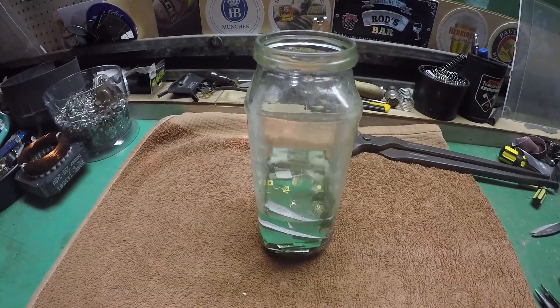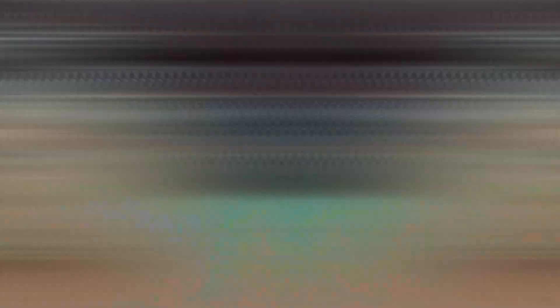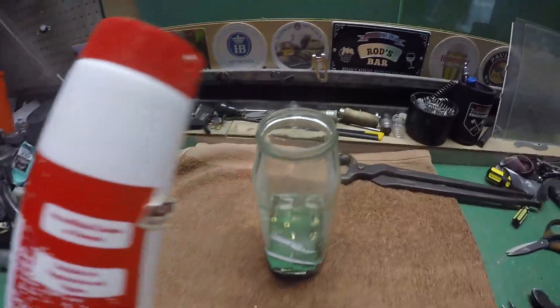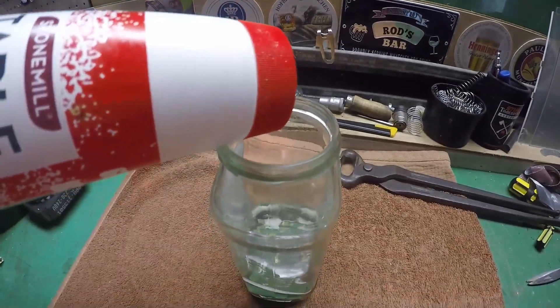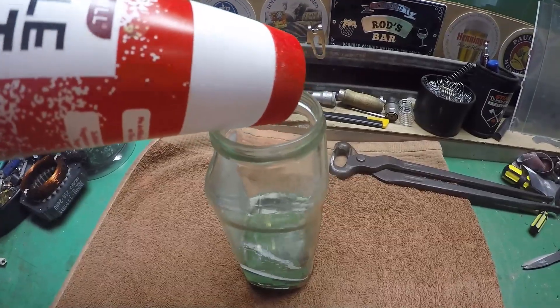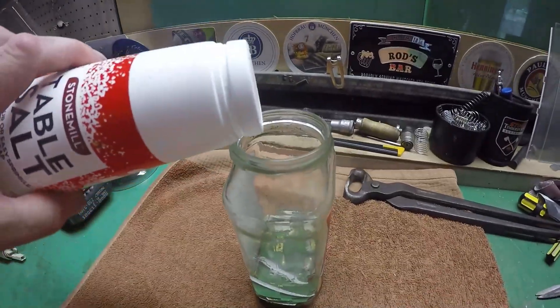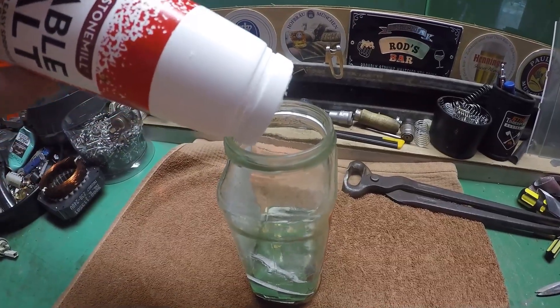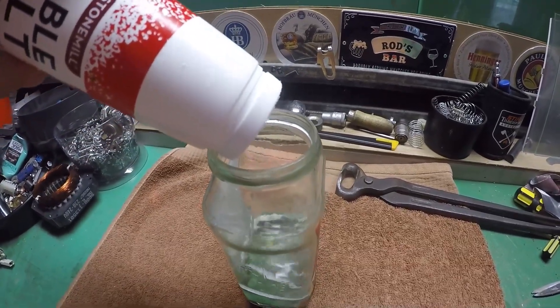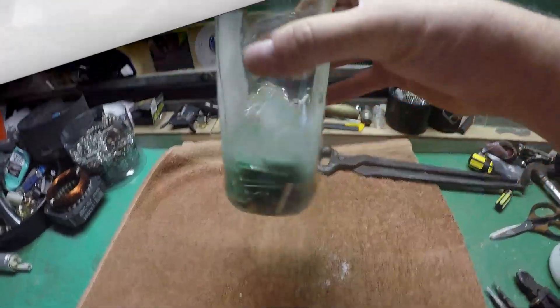Well guys, in my haste to get this underway I forgot to add one important ingredient: some table salt. Let's take the lid off and get some in. I think it said about a tablespoon — oh Jesus, well she's got some salt all right!